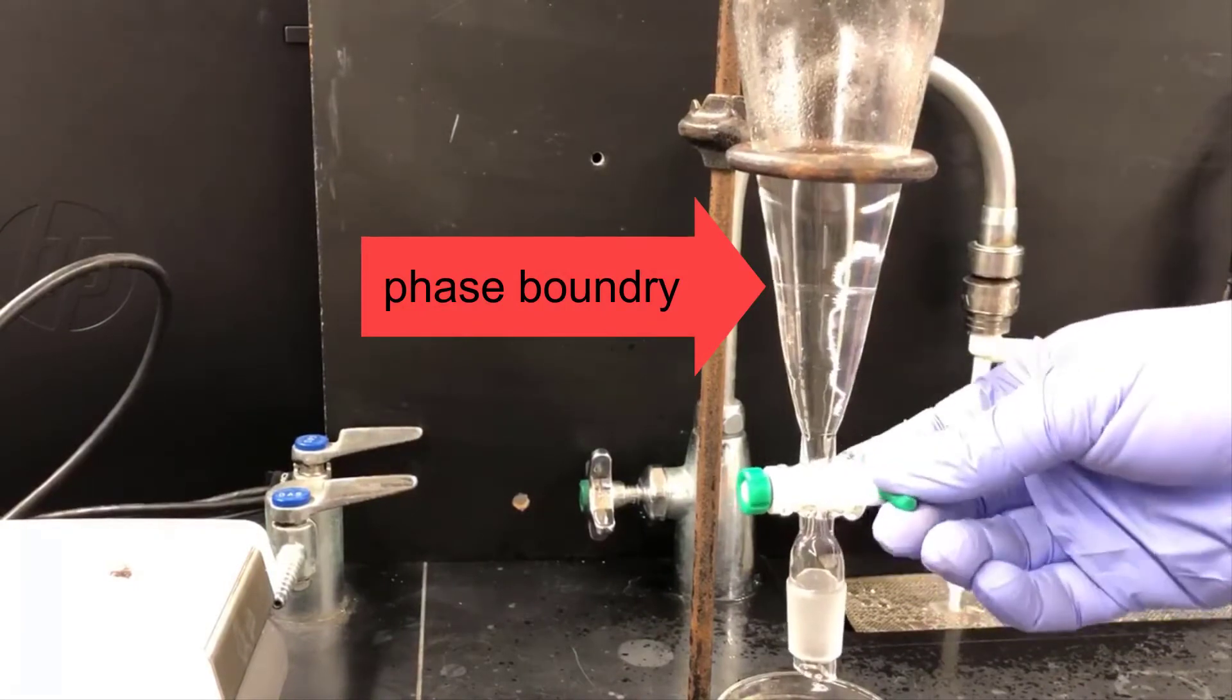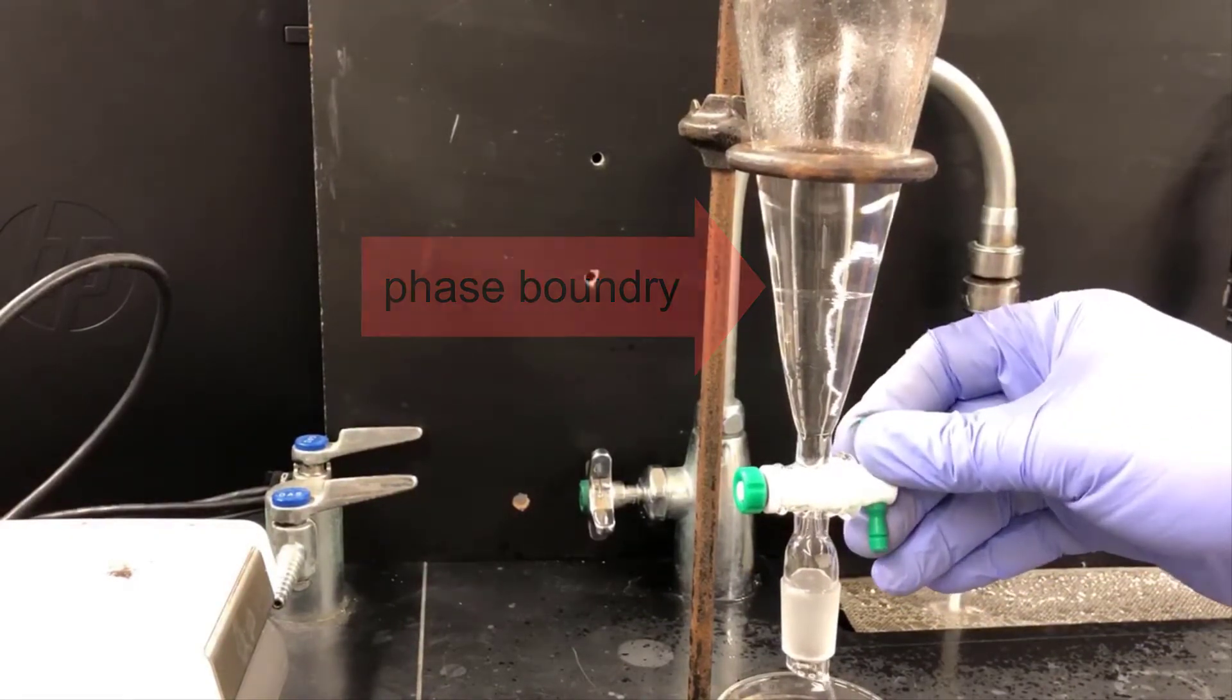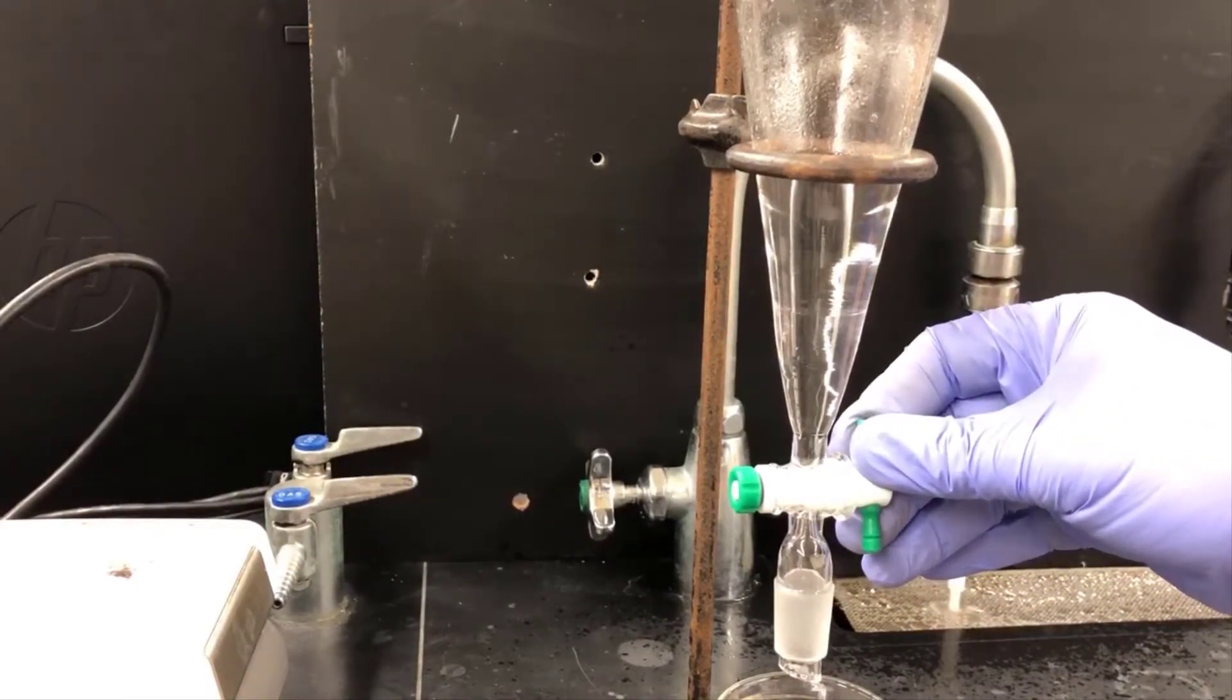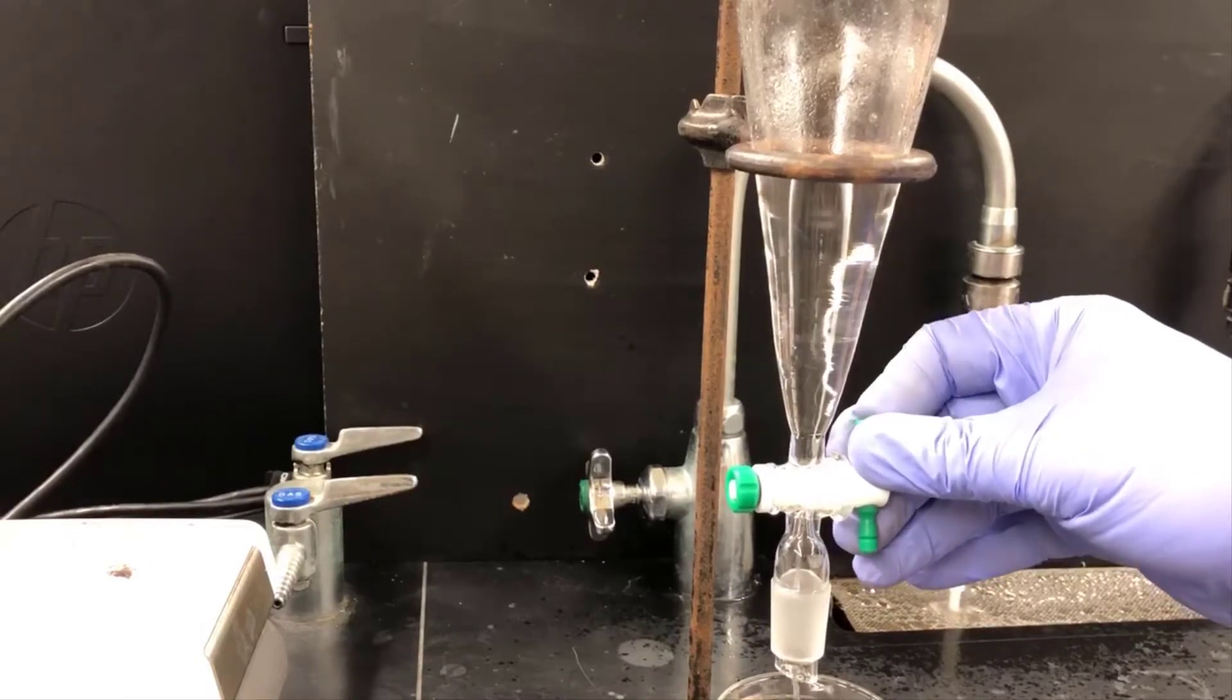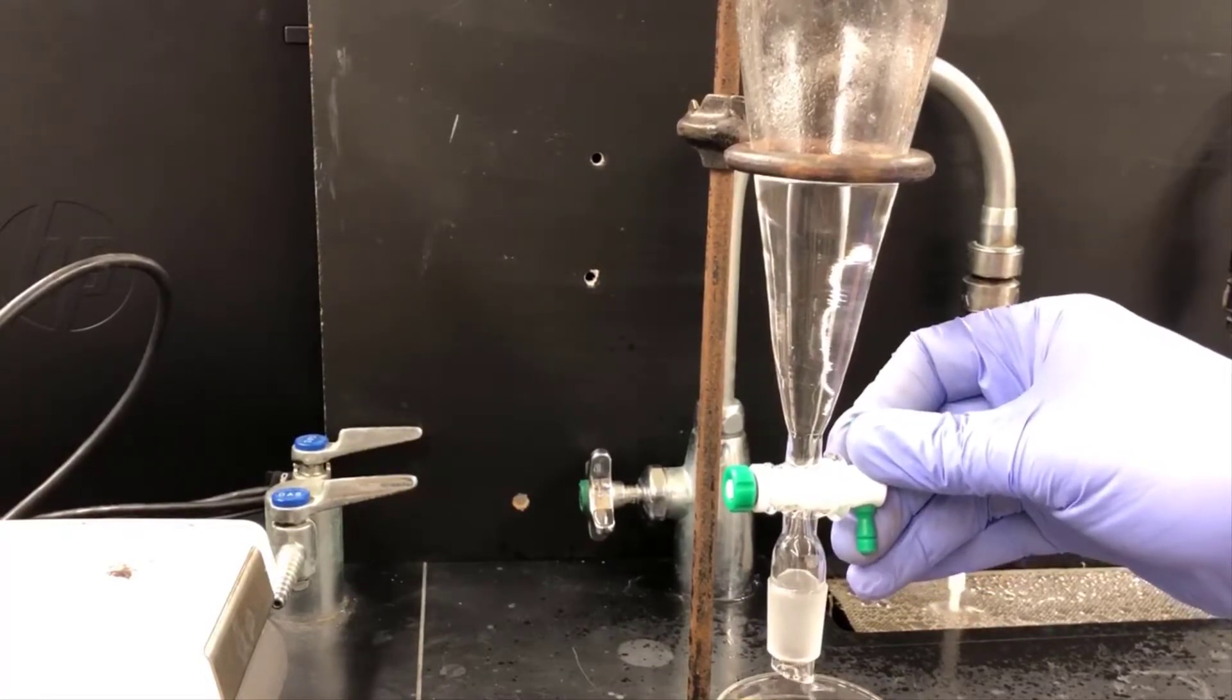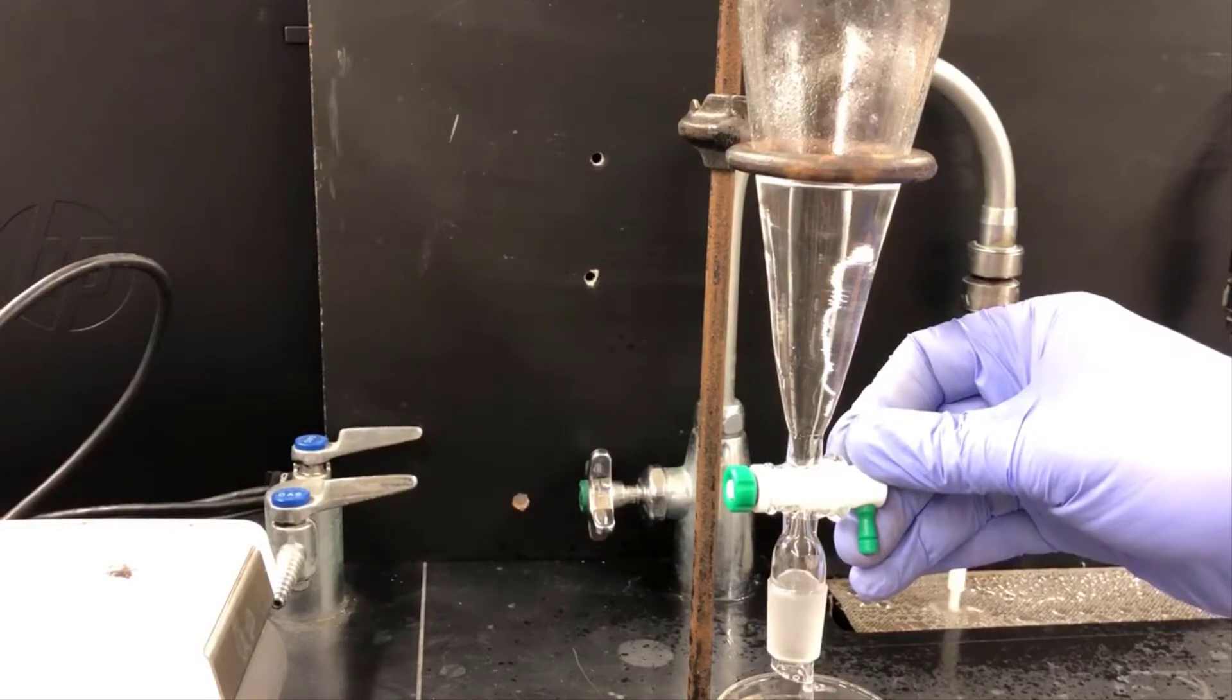Here's a close-up of the separatory funnel so you can see the phase boundary between the two liquids. The lower phase is the brine phase, and I'm draining that off into a waste container below. The upper layer is the clarified ethyl acetate layer that contains caffeine.